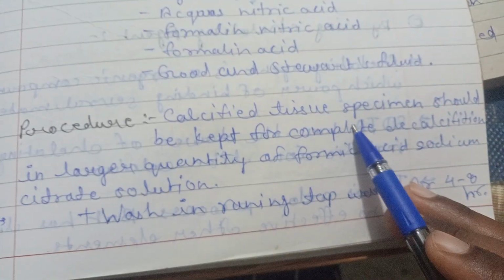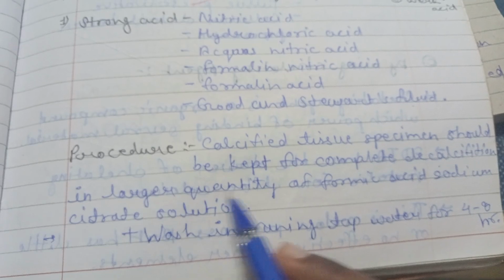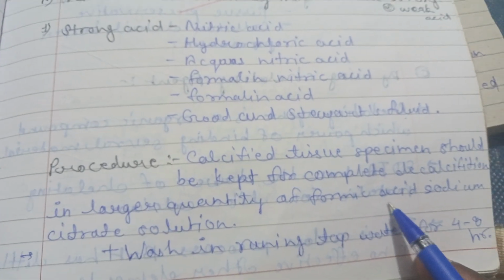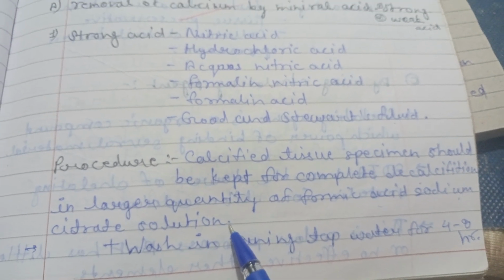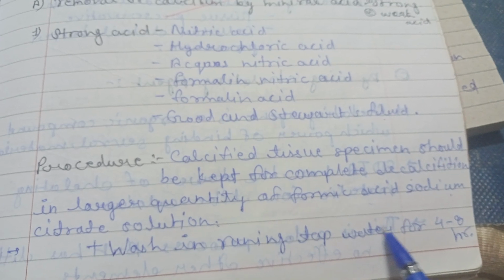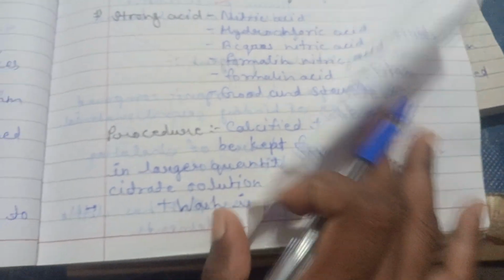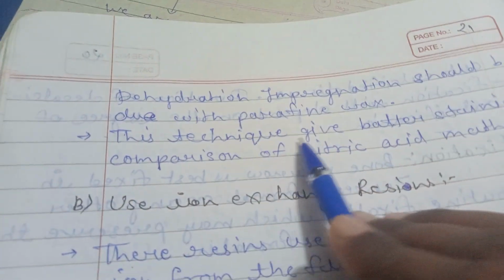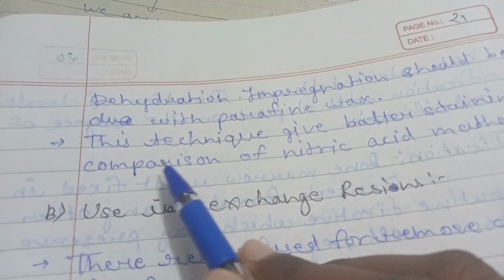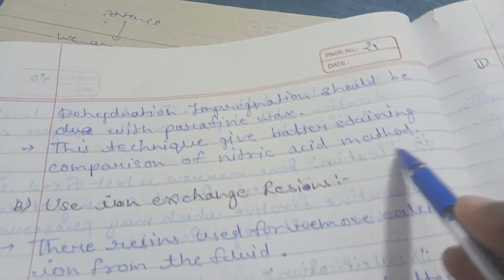Procedure. Calcified tissue specimens should be kept for complete decalcification in a larger quantity of formic acid, sodium citrate solution. Wash in running tap water for 4 to 8 घंटे के लिए. Dehydration. Impregnation should be done with paraffin wax. This technique gives better staining compared to the nitric acid method.